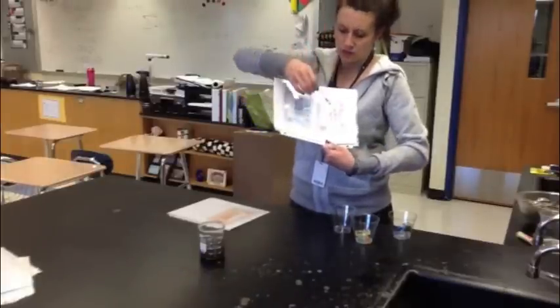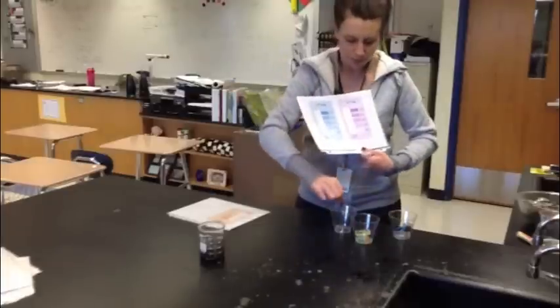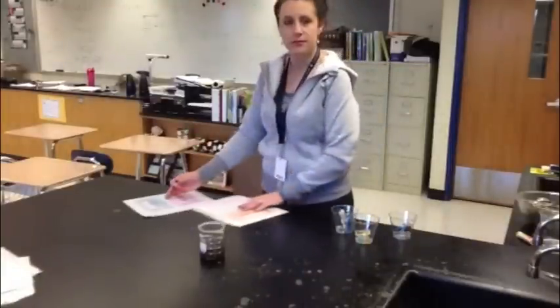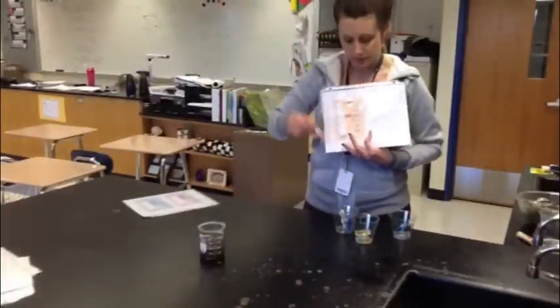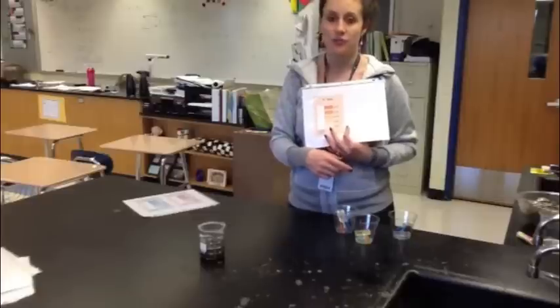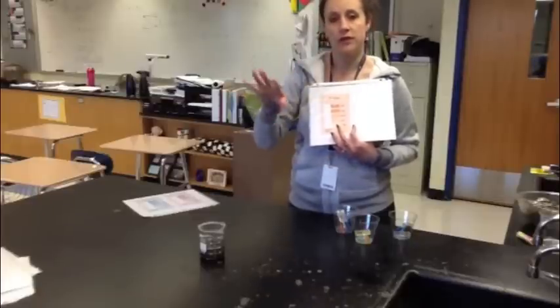Do this for each test. Do it for the nitrogen test, which is kind of purple; the phosphorus test, which is blue; and the potassium test, which is this orangish color. You're going to fill out the chart for Soil A, Soil B, and Soil C, and then you can have that whole entire chart filled out.